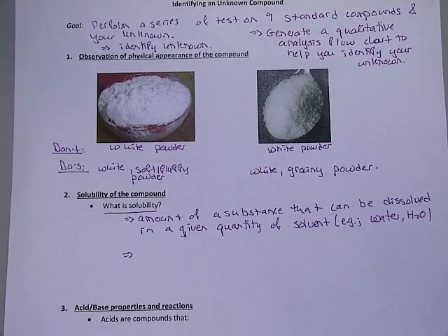One thing I observed from last week's experiments: never put your finger on top of a test tube and mix. That is very dangerous. So your lab instructor can demonstrate how to properly mix a test tube. You can also use a stir bar to mix your substances. One thing I want you to know is that anything that is insoluble in water will never dissolve regardless how much you mix it, how much you heat it.